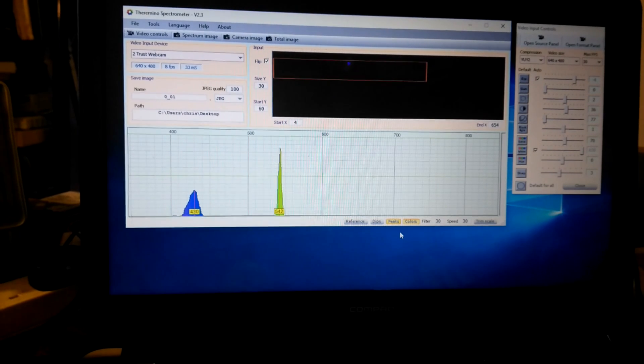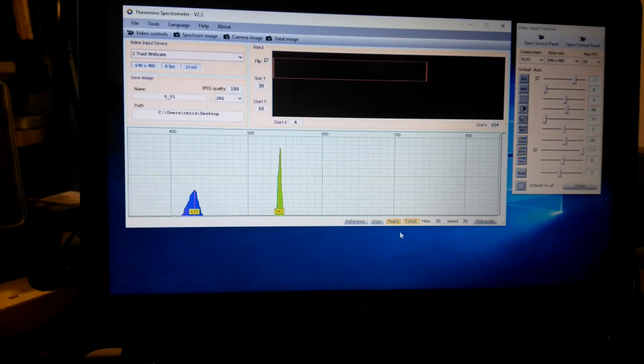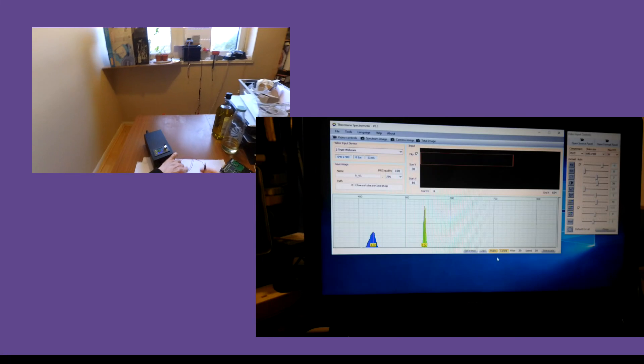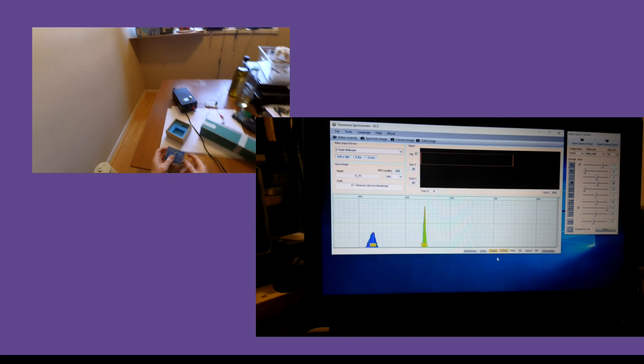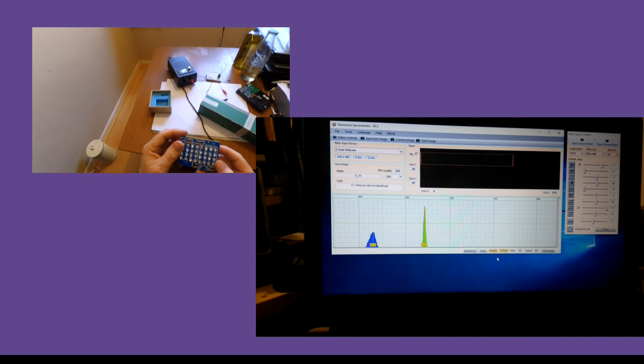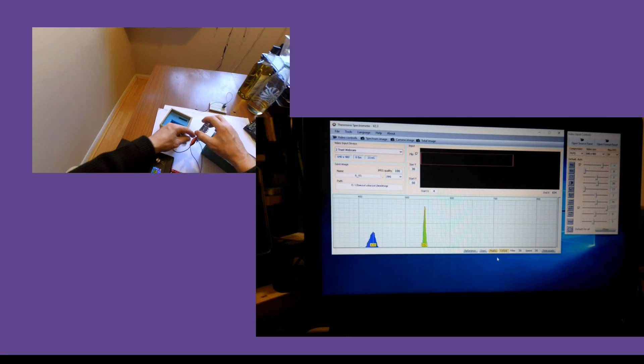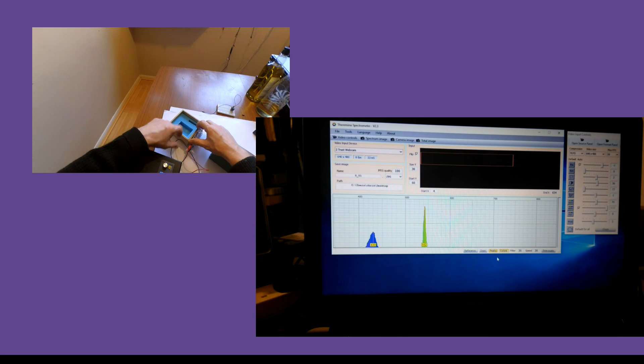Now let's also get this infrared panel. Just get the data point from this infrared panel. I don't know what voltage it starts to come on at, but we'll start low and go up steadily. Oh.